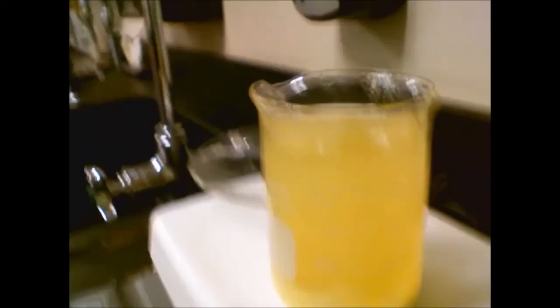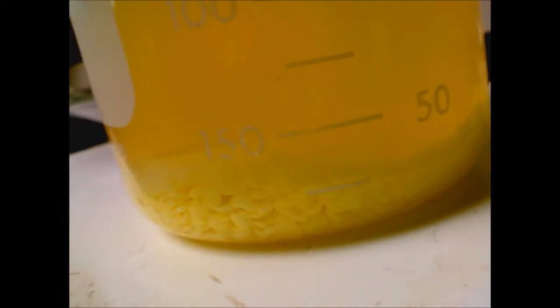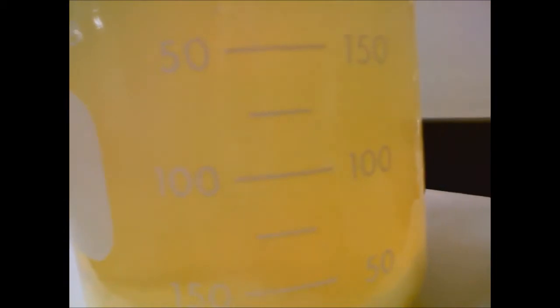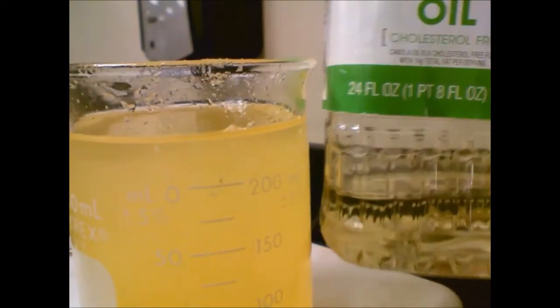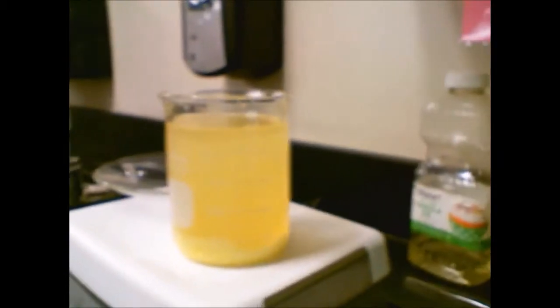So as you can see with our solution, we have now a layer of what looks like almost dust on top of our pellets. That is where the particulates have settled out, and we now have a nice clear, or clear-ish, yellow solution, very much more yellow than, say, that. So definitely sulfur in that solution. I'm going to set you a little bit closer than I had been.